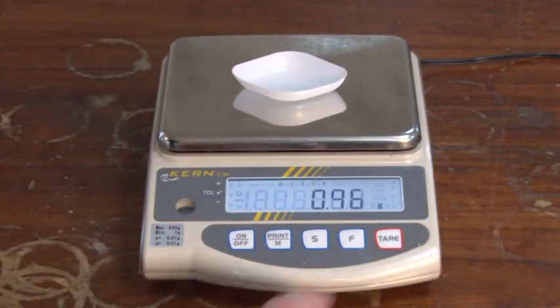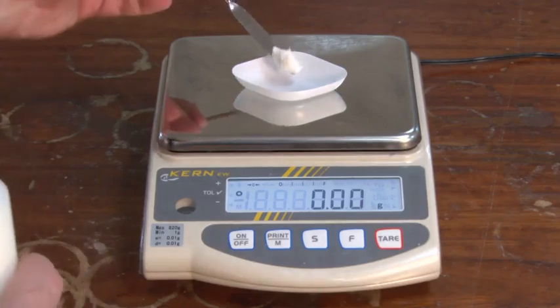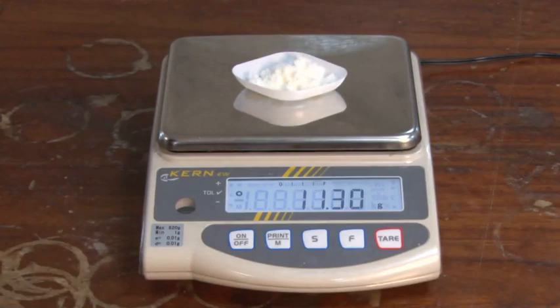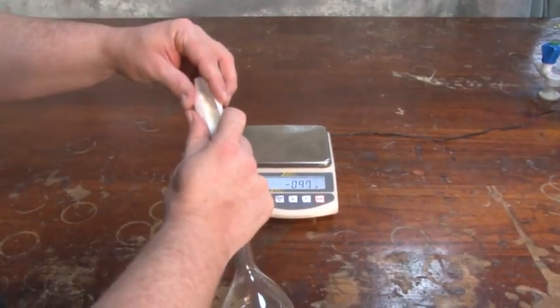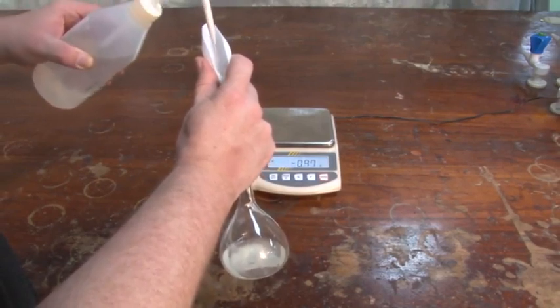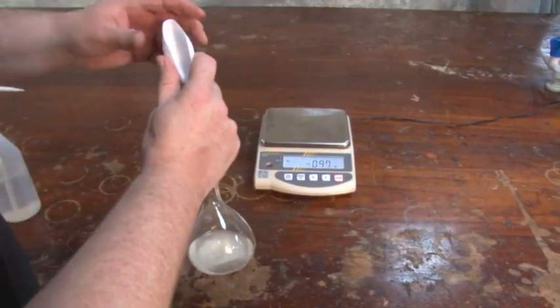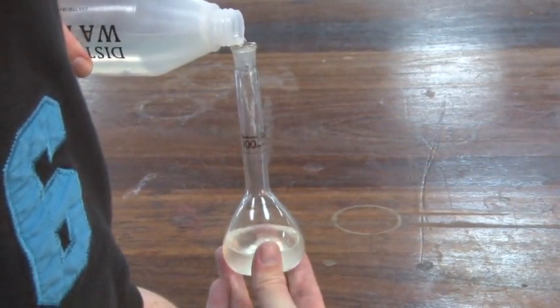So, for the calibration reaction, accurately weigh out 11.30 grams of powdered sodium nitrite. Transfer the powder to a 100 milliliter volumetric flask by rinsing it from the weighing boat with a wash bottle. Now add distilled water to just short of the mark.